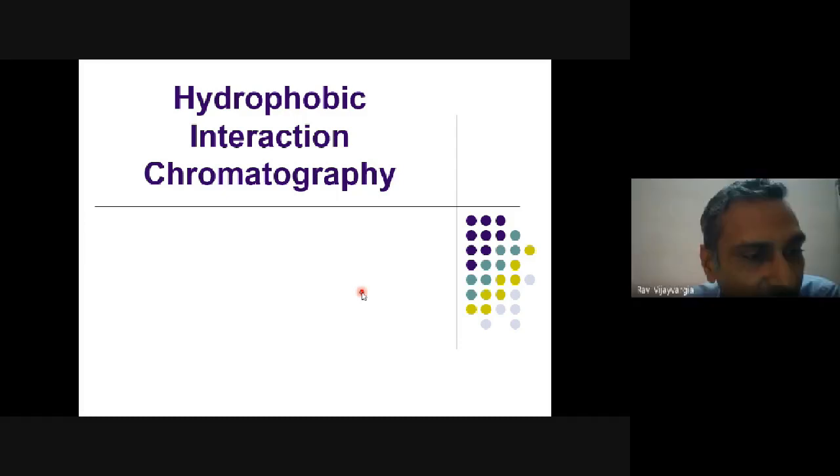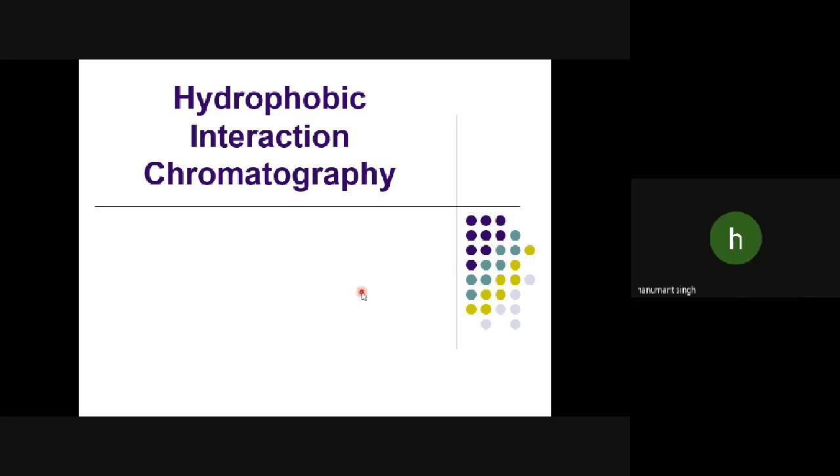No. If you don't have a ligand, then you have to artificially add a tag to it. That is what you do. Sir, that works for the protein. Suppose we have some other substance, not like that. If any other polymer is there which we need to separate out, in that case, how to do that?